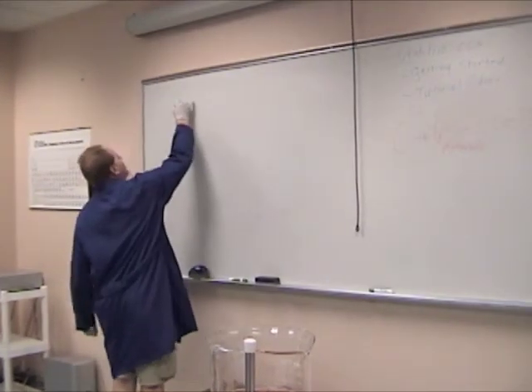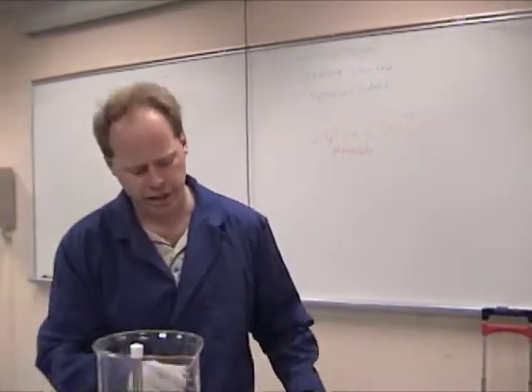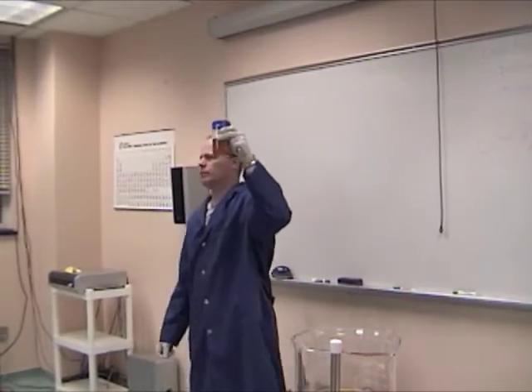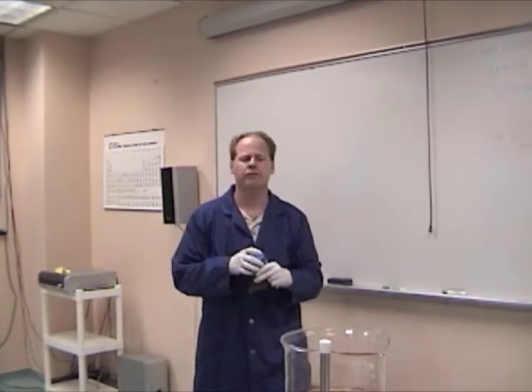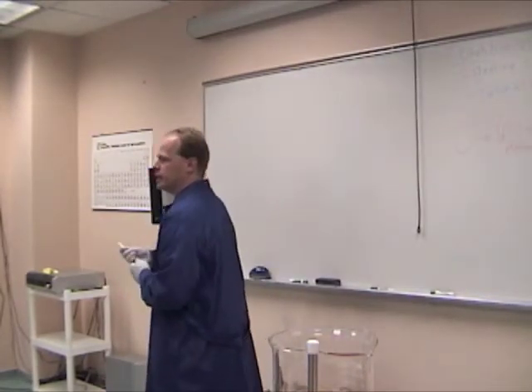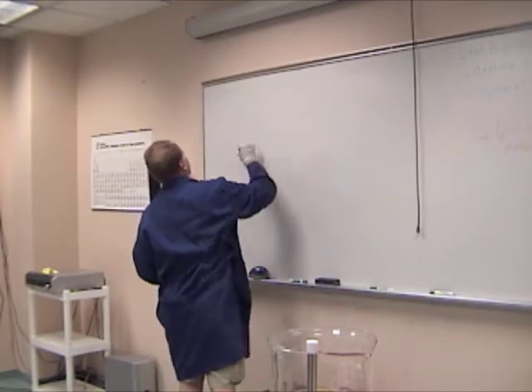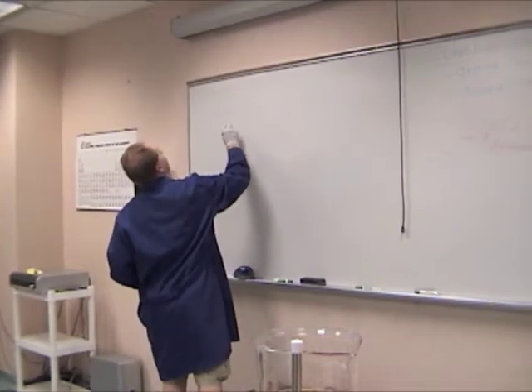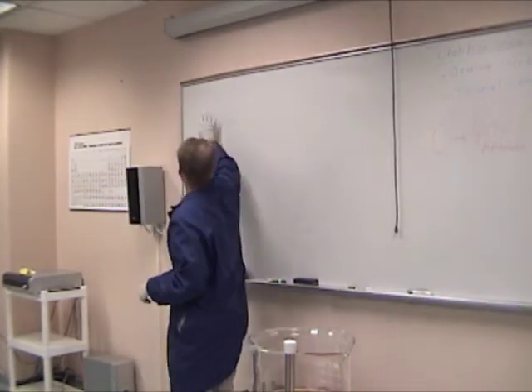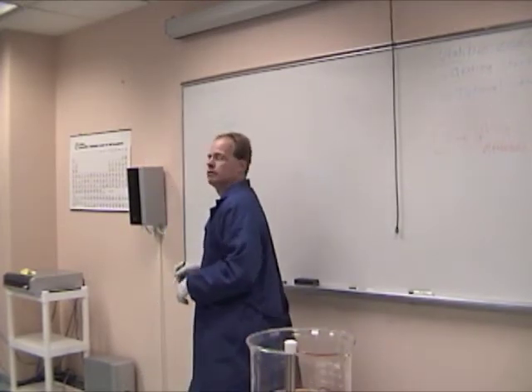We have oil. As I said, it becomes acidic, or we get those free fatty acid chains that break off of it as it gets older. How we measure that is by taking a titration. So I've got this oil here, and it's got a couple free fatty acids floating around, so I've got some oil that has an unknown acid content. In other words, what percent of this oil has free fatty acid floating around in it?